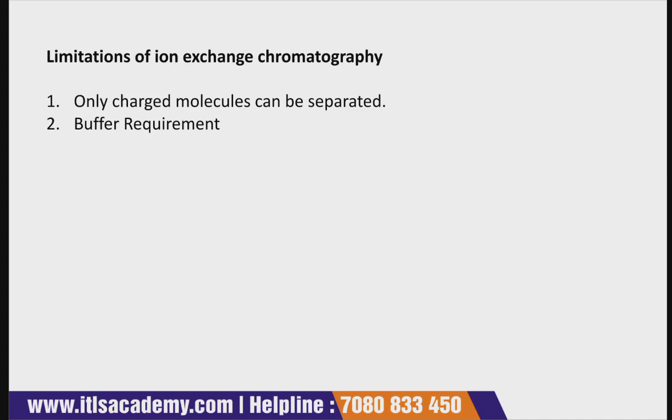But uncharged molecules cannot be separated using this technique. Buffer requirement is always there, because without buffer they cannot be separated. So these are certain limitations of ion exchange chromatography.